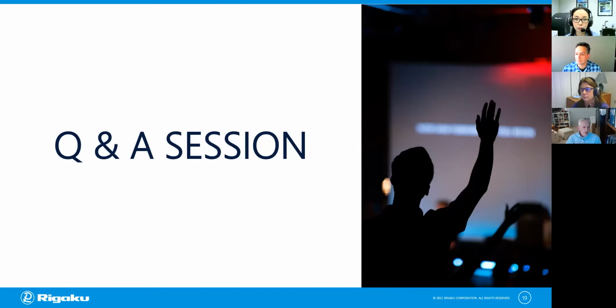And something we've been experimenting with for a while now, and we'd love anybody who wants to work with us or test this, is this: if you have a population of voids and you're not sure whether they are different because they're elongated or have some other attribute, you can select a dozen of these voids and a dozen of another population, and ask the software what's different about these, and go find the rest of these populations. What we've seen today has been a lot about segmentation and machine learning on how to label pixels. But now what I'm talking about is machine learning and classification of measured particles.